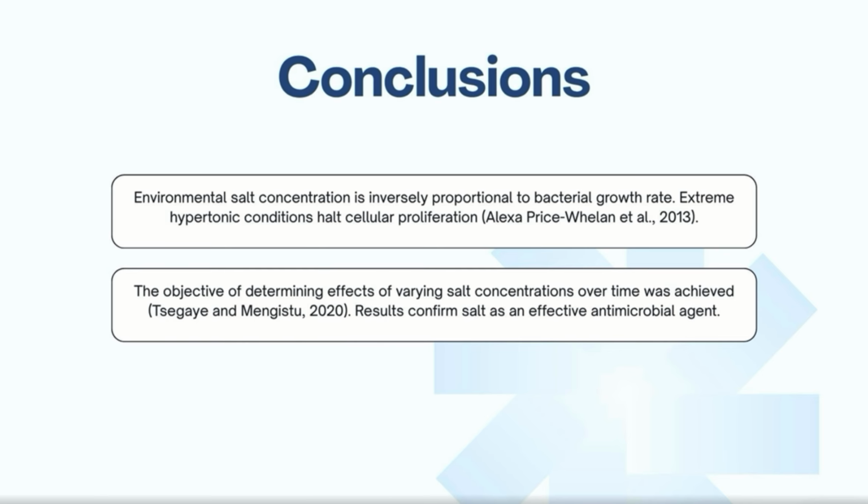In conclusion, our study confirms a clear inverse relationship. The more salt in the environment, the slower the bacteria grow. At extreme levels, growth stops completely. This confirms our objective and proves that salt remains a highly effective antimicrobial agent.